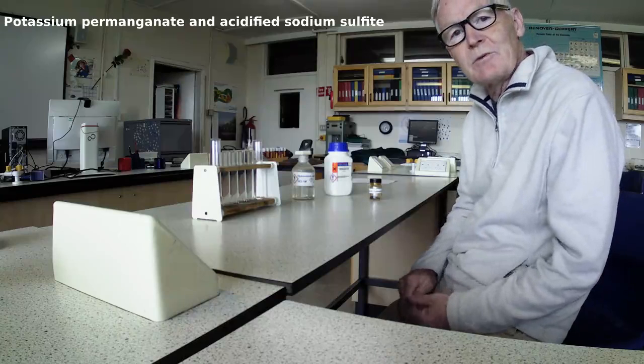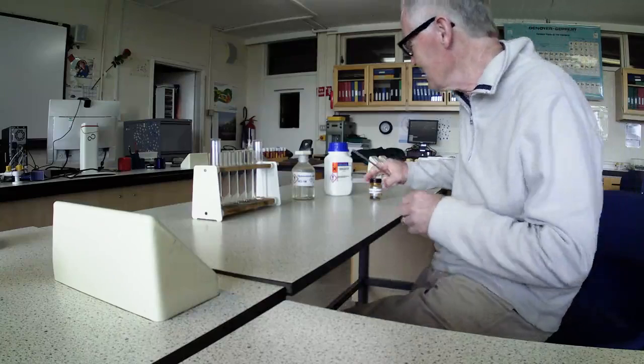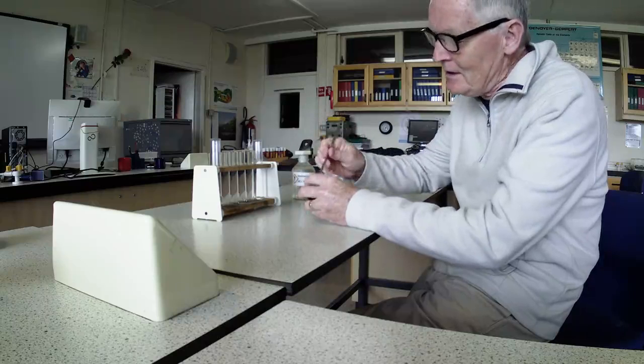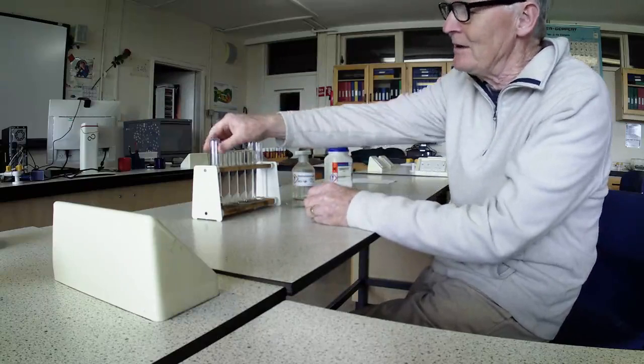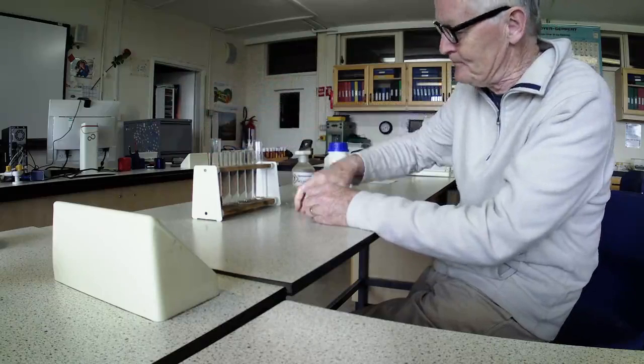The first experiment we're going to try is the reaction of potassium permanganate with sodium sulfite. So this is potassium permanganate. I'm going to put a few crystals into some water, and we end up with this nice purple solution.